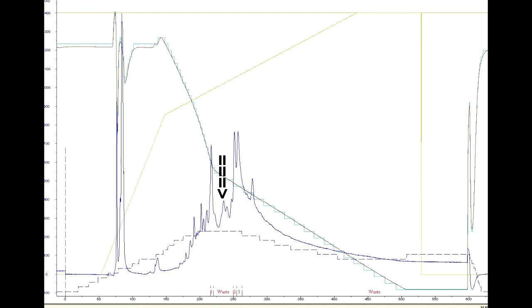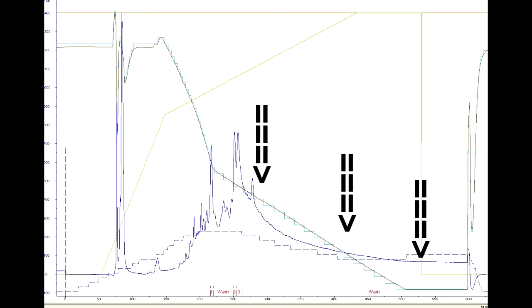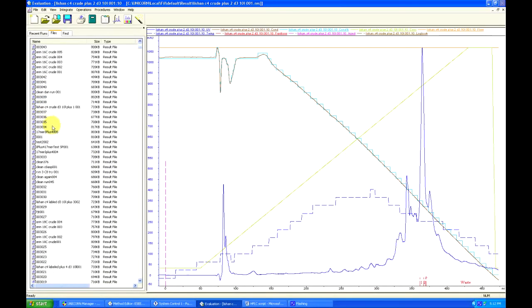And so the rest of those peaks are now going to the waste until we saw another big peak come out, which is the second peak. We inserted a 10 again and pressed execute, and so the second fraction was being collected. Then we realized that the second peak actually had another component, so we had to hit execute again with 10 still in it in order for the fraction collector to quickly switch from 2 to 3, the third test tube. And finally, when the third peak was finished, we hit 0 and pressed execute, and the rest is waste.